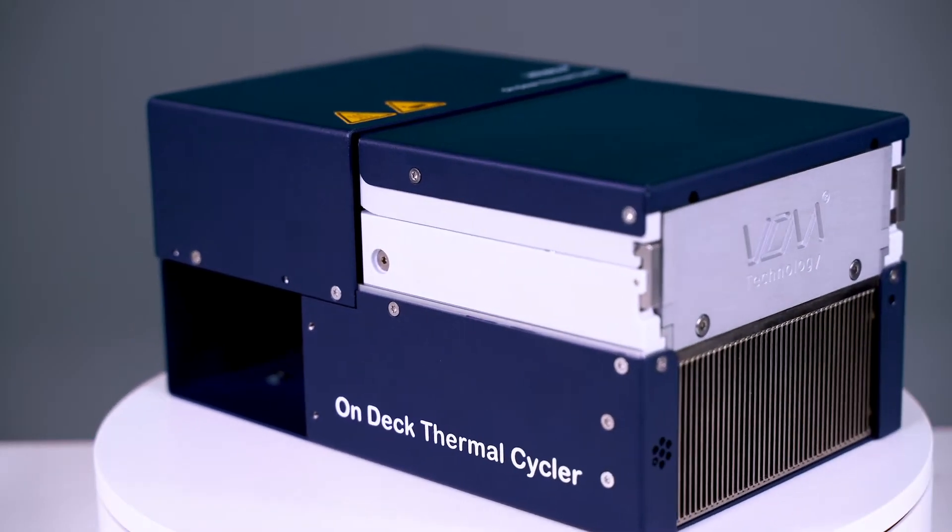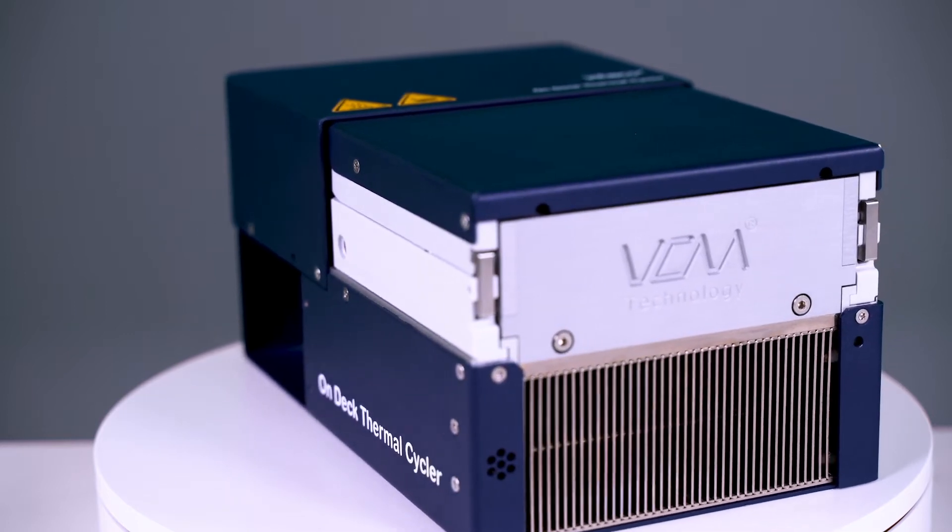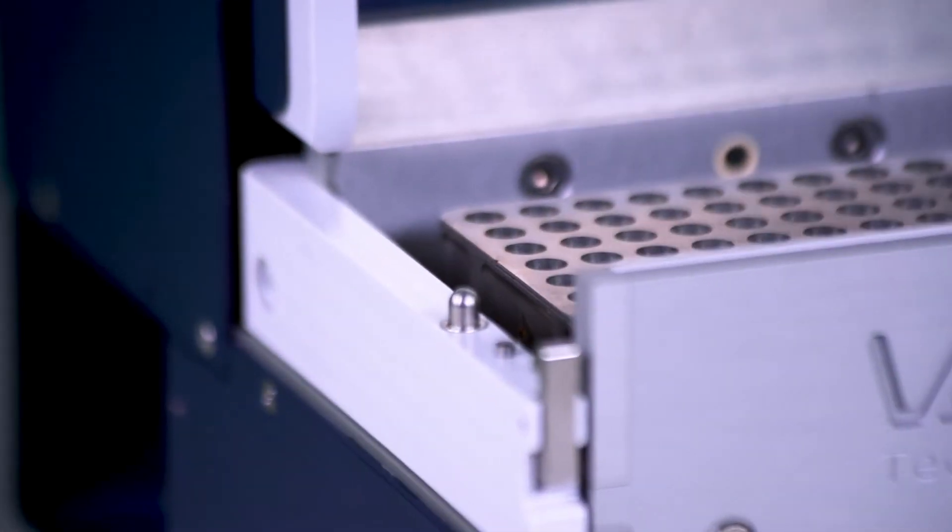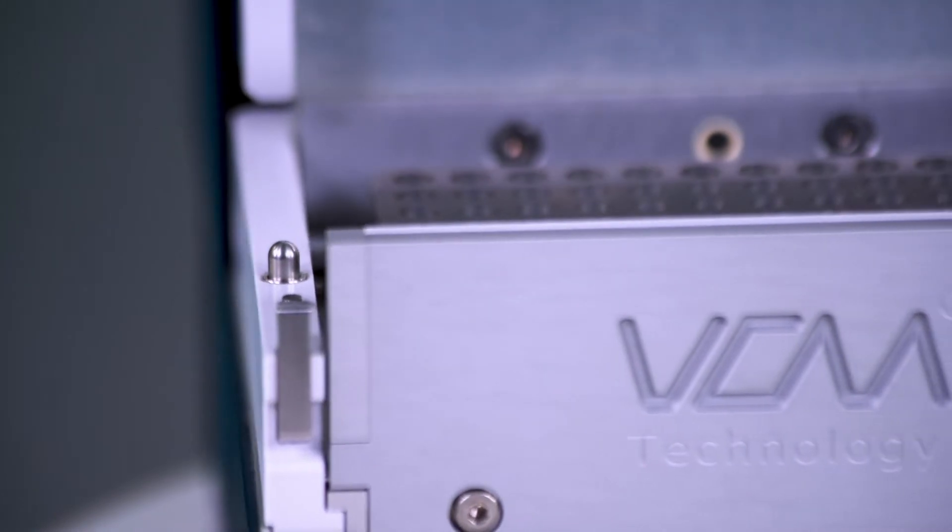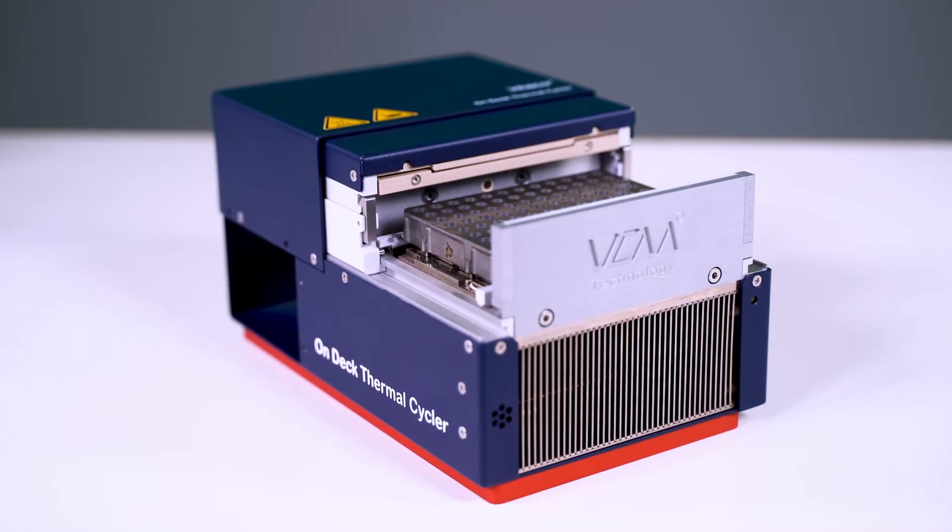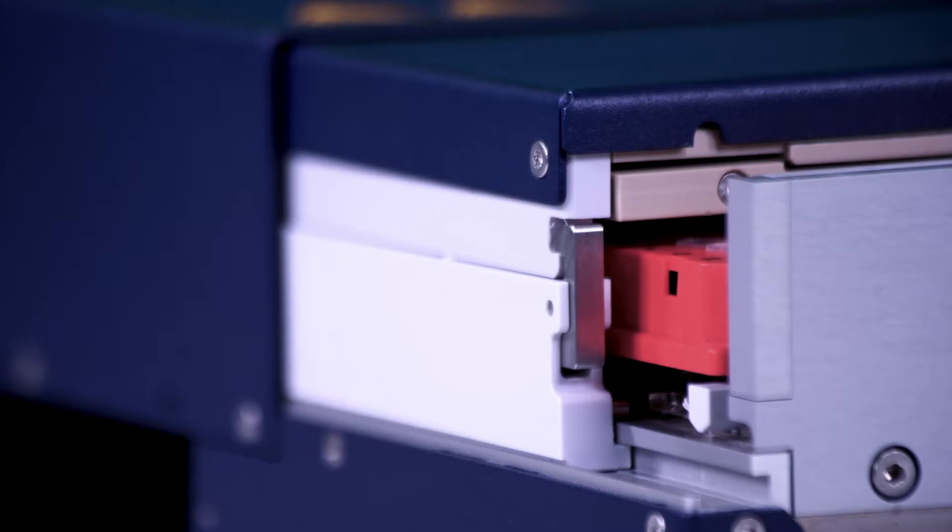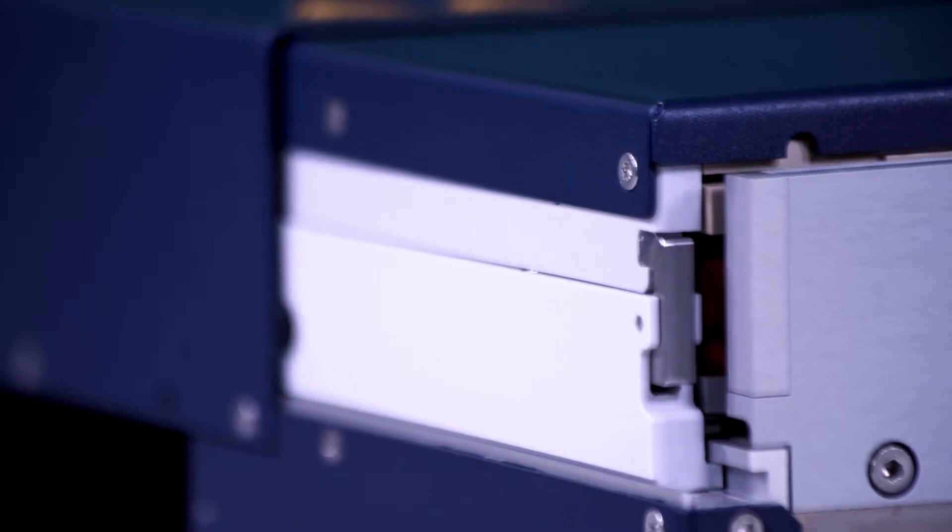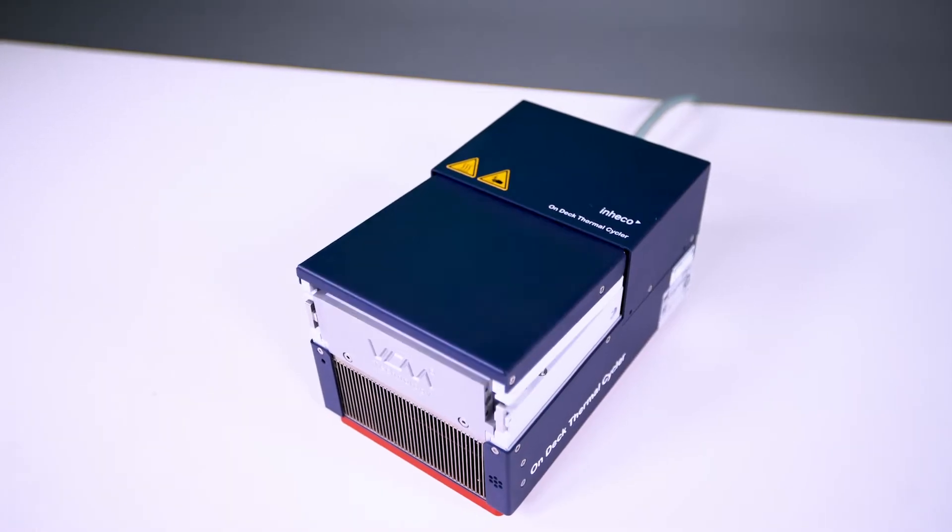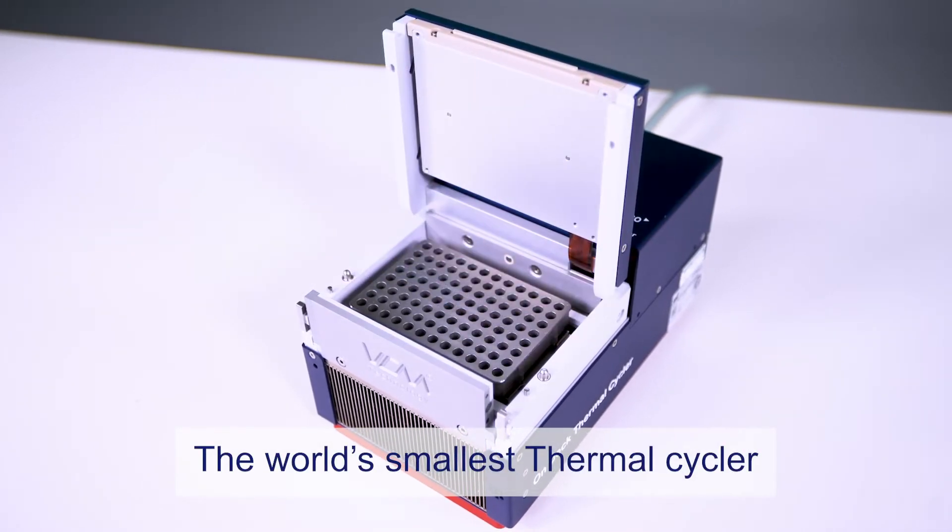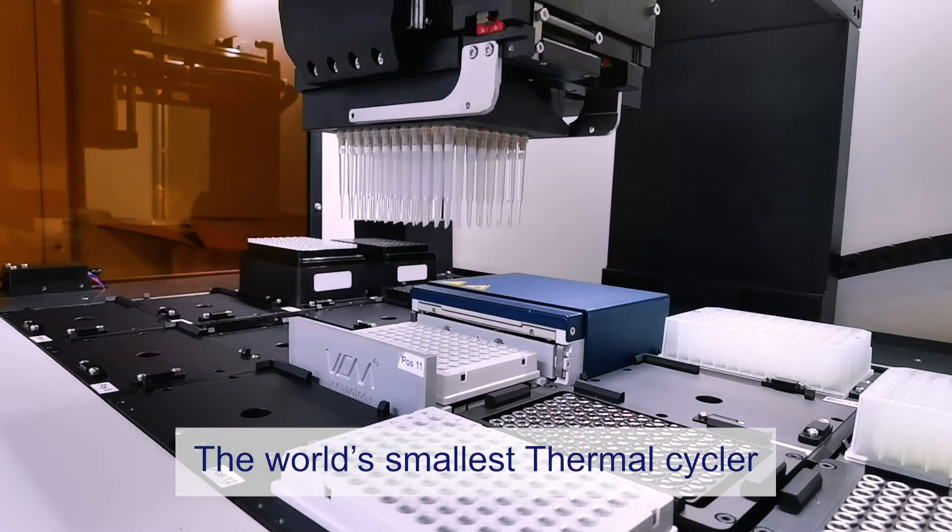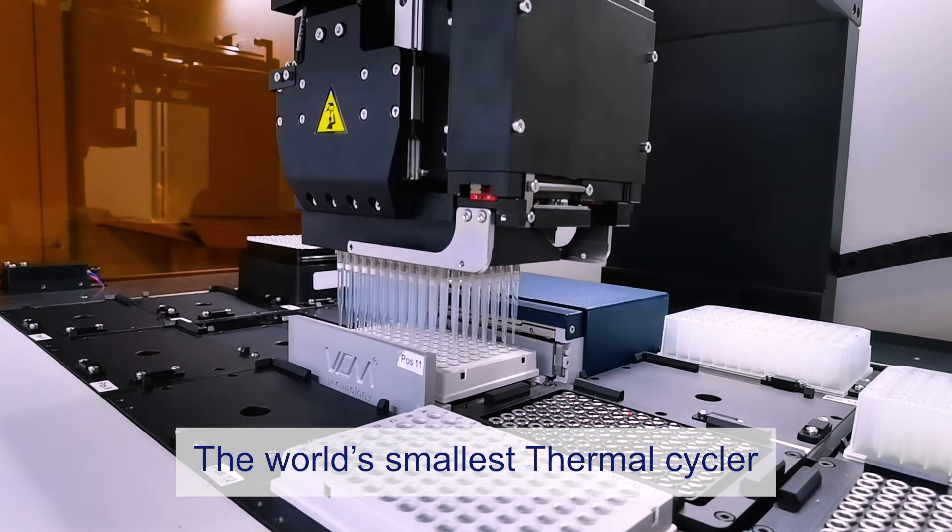With 20 years of experience, we know that space is at a premium when designing and implementing on-deck solutions. With our on-deck thermal cycler, we focused on performance and space optimization. The ODTC is the world's smallest thermal cycler, at least 30% smaller than our closest competitor.